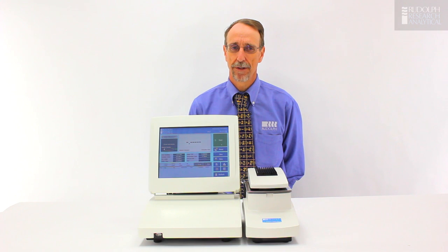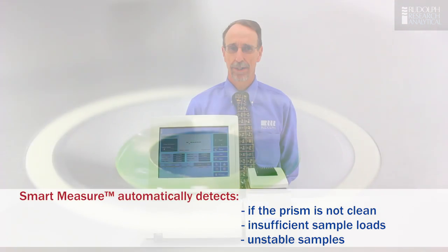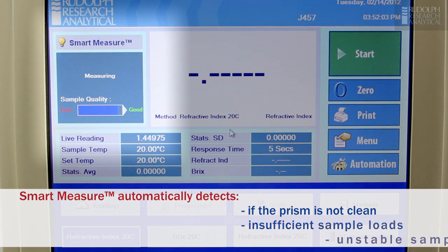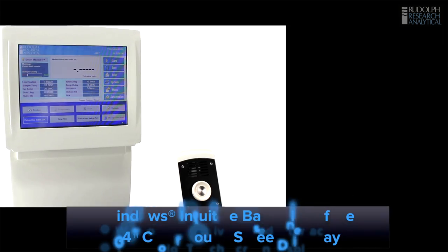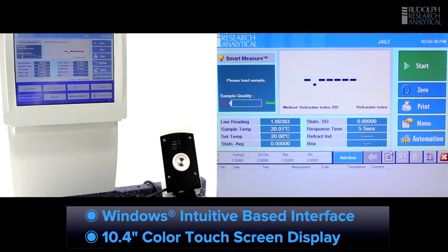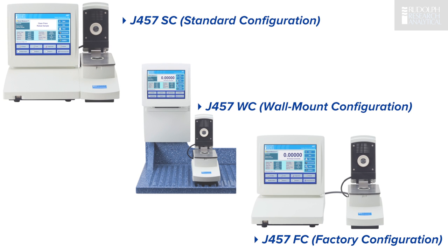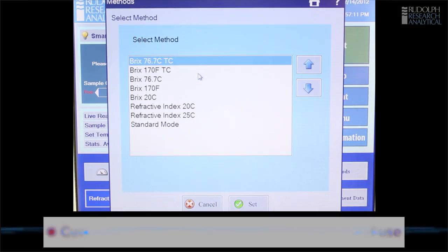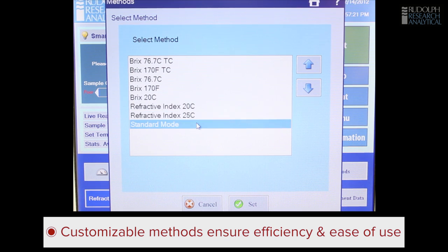The J457 also features many new innovations. The biggest is SmartMeasure, a complete system to assist the user with always measuring the right sample at the right time with the right amount of loading with the instrument cleaned correctly. It has a splash-proof separate measurement unit, the convenience of a user-friendly touchscreen display, and it's fully networkable. It can be set up in multiple configurations for different industry applications.